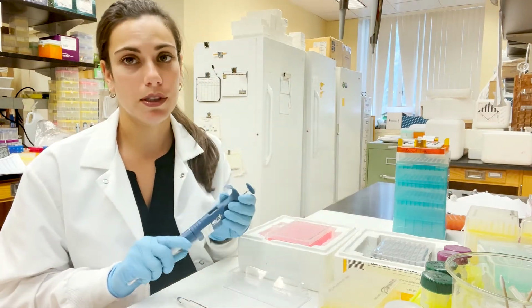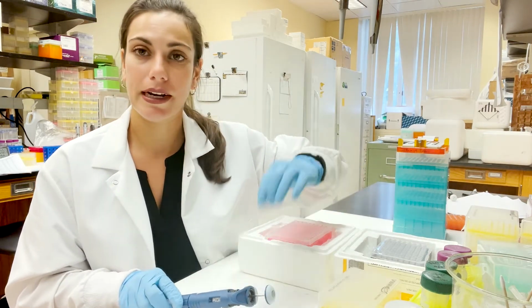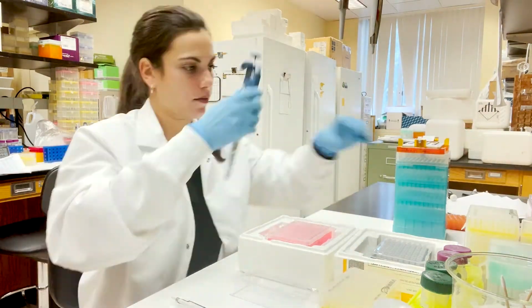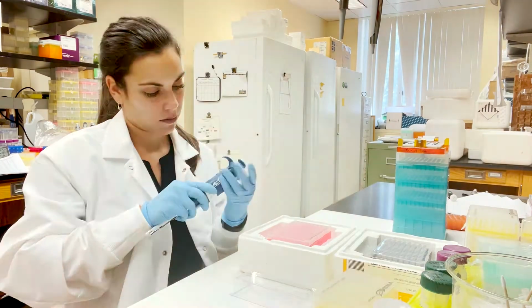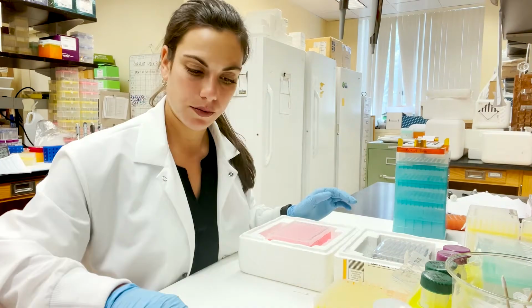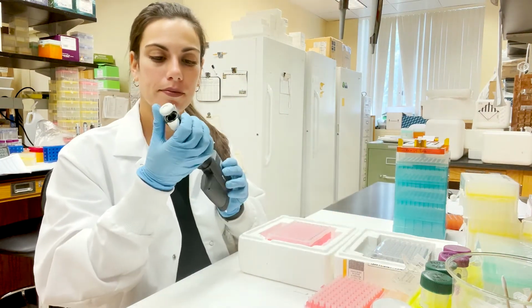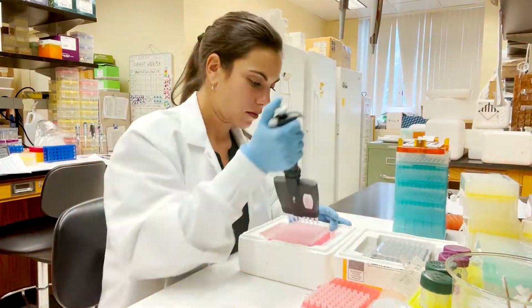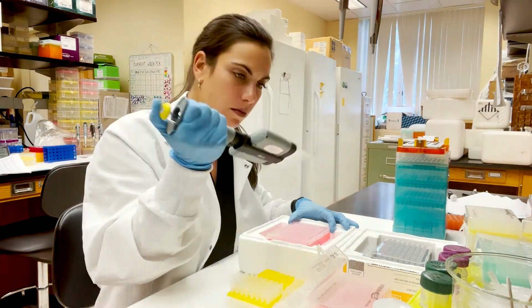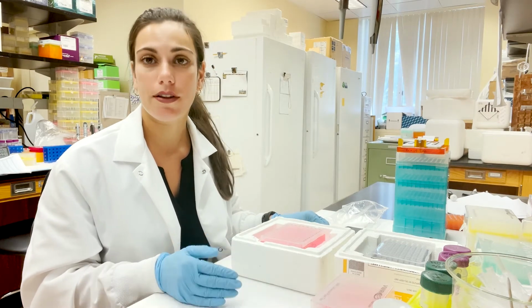So again, they're also multiplied by 54 so that I have enough for all 48 of my samples, and then a little bit extra so that I can use the multi-channel pipette. Okay. And now we have 3 microliters of our clean DNA. So then we seal it with a microseal, spin it down, and then put it on the thermocycler.